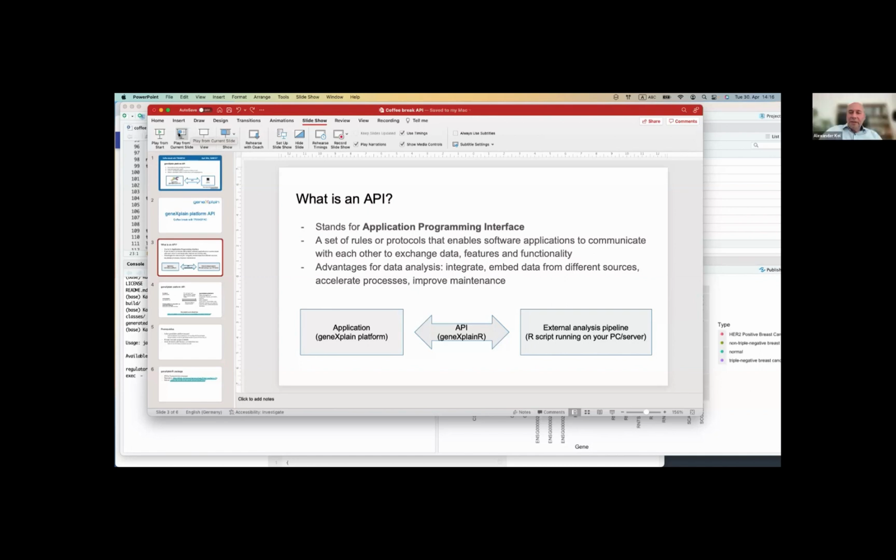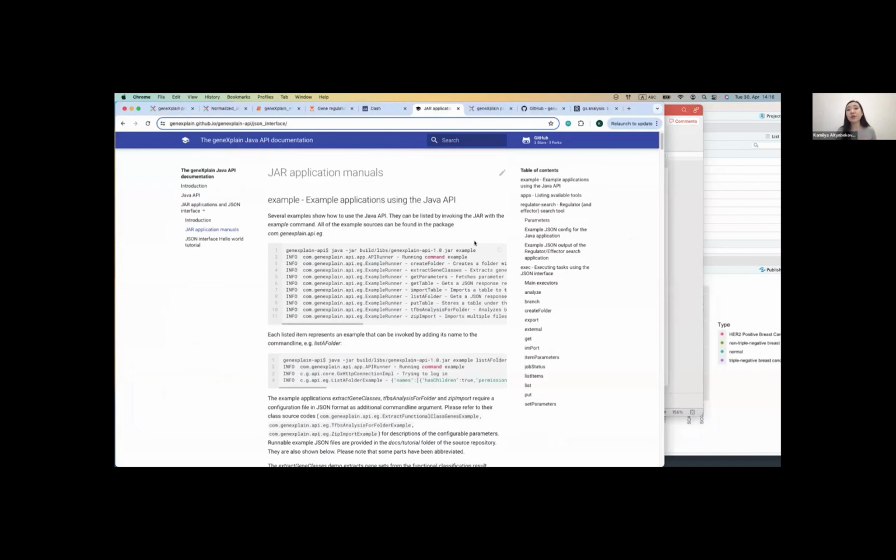All right. So there is a question from Kanika. Does the documentation provide details on the commands to be used on the Linux system? Yeah. So as I showed, I could show again. If you're using Linux and you want to work in the terminal in Bash, then maybe you will go with this jar executable API. With this option here, it can be just downloaded into your Linux system, and you can execute it right from the command line.